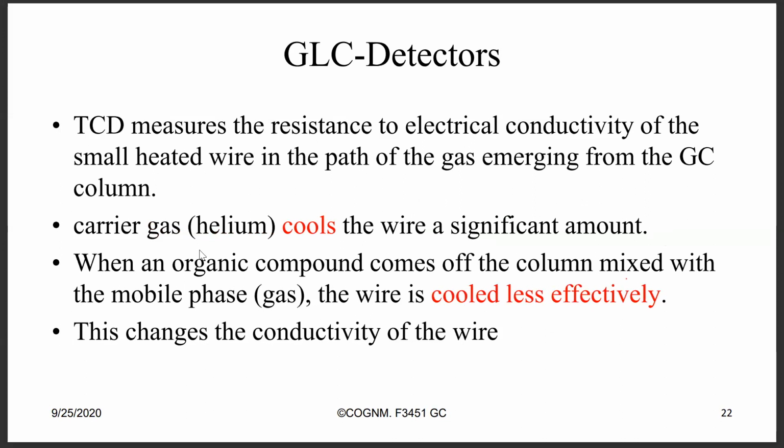TCD measures the resistance to the electric activity, pretty much the same thing. There's a higher resistance when we have analytes. Therefore, we will know what it is.